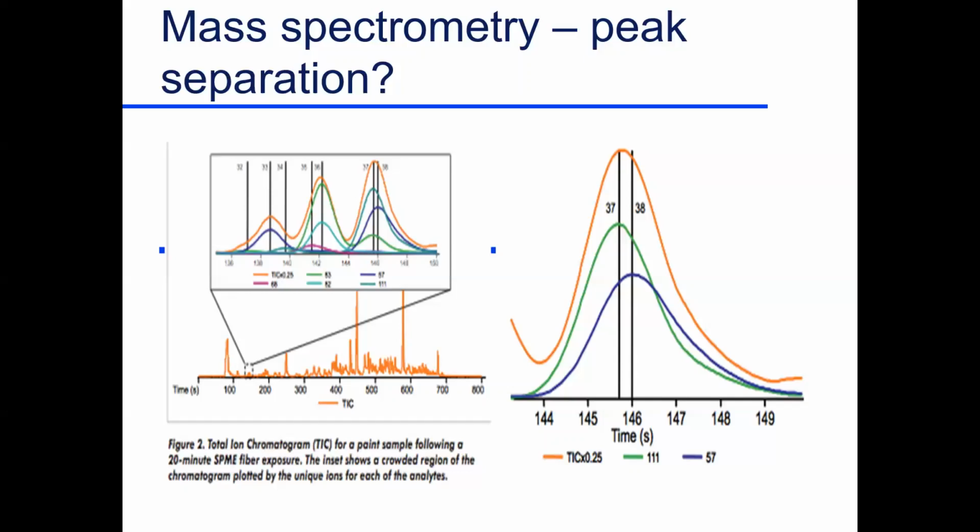If we look at our gas chromatograph and watch our recorder on the screen, the peak comes up like this and goes down. If you took a look at that, you'd say, oh, that's one compound. It's nice symmetry. You always look at whether the peaks are nice and symmetrical, or kind of lopsided, like there might be something else with it. That can give you a really nice symmetrical peak. But guess what? If you look at it, it's made up of more than one.